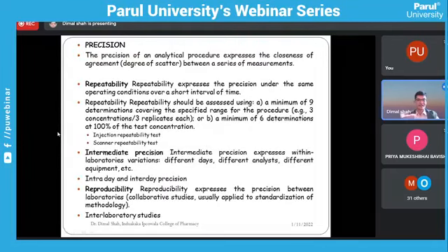Precision study, intra- and inter-day studies. Along with that, repeatability studies are also to be carried out. In the injection repeatability study, the same concentration and the same volume of compound are to be injected on a plate, and whether you are getting a reproducible result or not is to be checked.